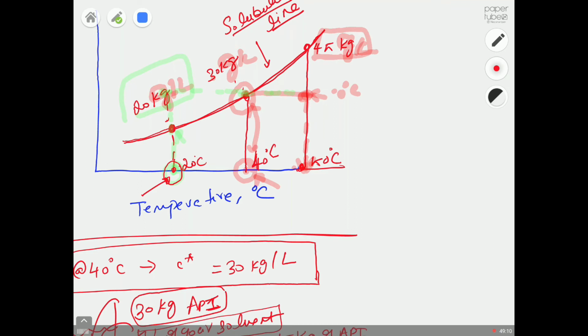And when you're thinking about creating a supersaturated solution, we need to heat the solution some temperature above. I just want to highlight this particular point again, like 40 degrees centigrade. There is no rule that we have to heat it to 50 degrees. We can heat 40 plus 5 degrees centigrade, 40 plus 10, or 40 plus 20 degrees centigrade. We provide that extra bit of temperature just to ensure all the solids you add into the crystallizer are completely dissolved.